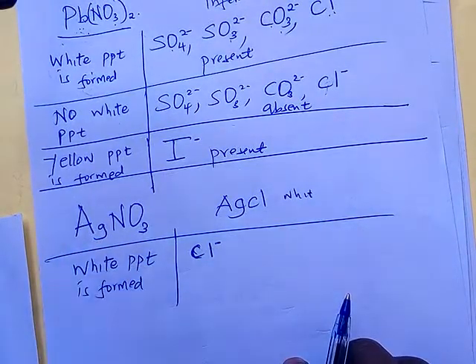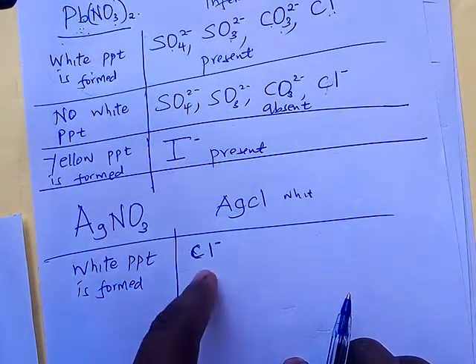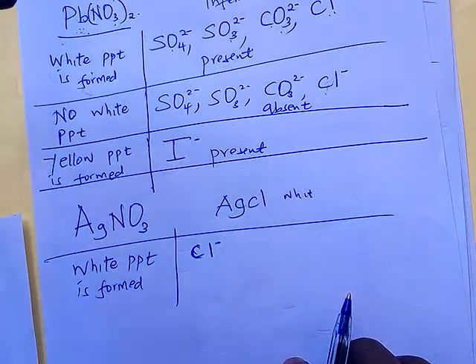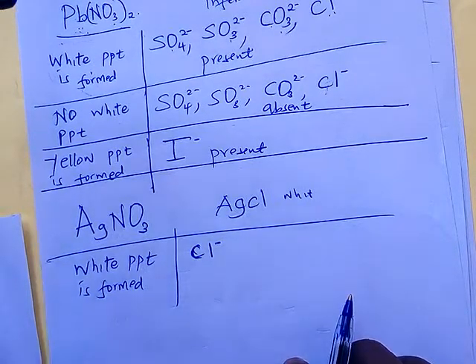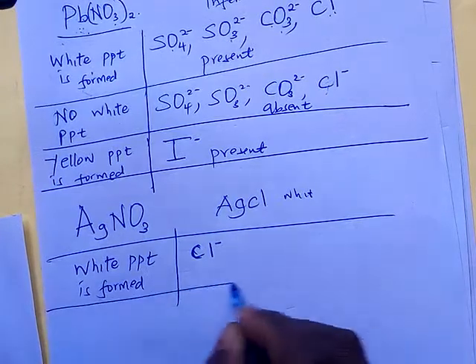We could have said there is a carbonate, but silver carbonate does not exist. I have not seen silver carbonate, therefore we are not going to write a carbonate. Yeah, that's correct.